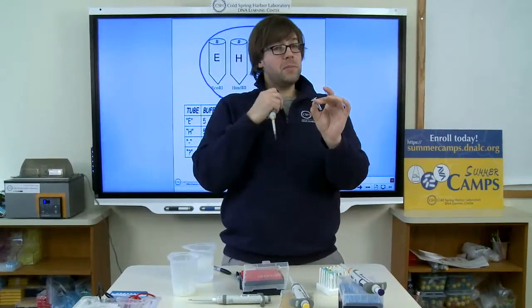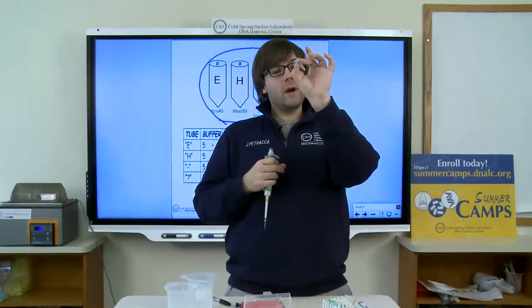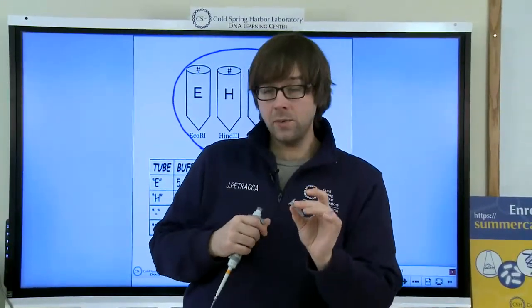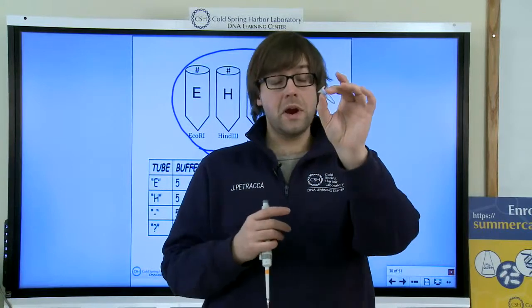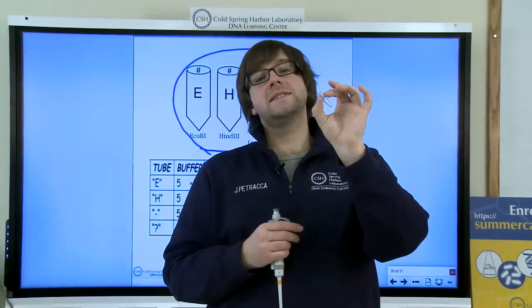And you'll see me measuring multiple times throughout the day. When I measure, I always hold the tube right up to my face like this. It may seem kind of silly, but it's for a good reason. You want to make sure that you see what you're doing and you can actually confirm that you're taking up liquids and your pipette tip is where it needs to be. So I'm always going to hold my tubes up to my face like this when I measure.